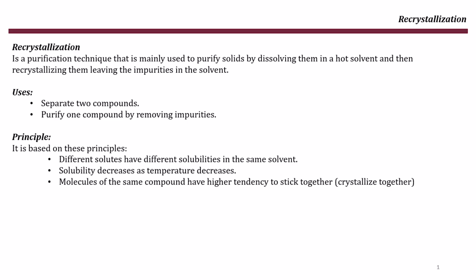The first is to separate two different compounds that have different solubilities. The second is to purify a single compound by removing small amounts of impurities.